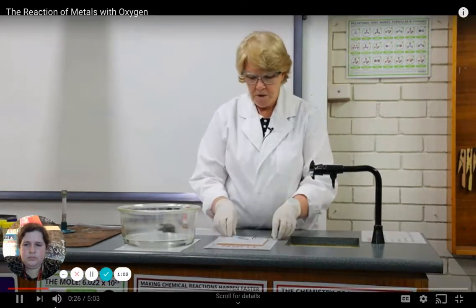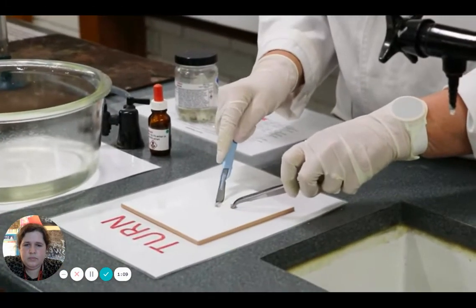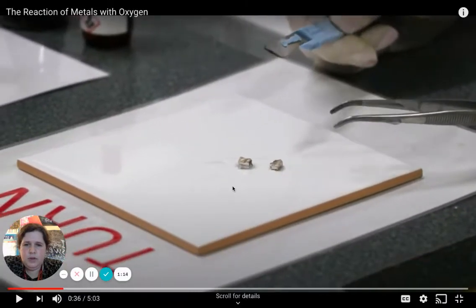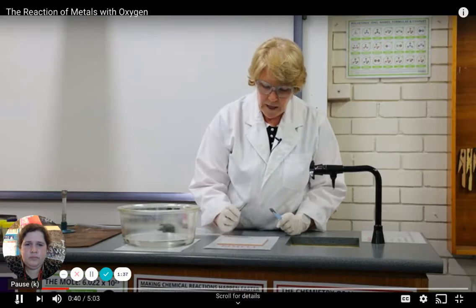Let's cut a fresh surface and observe it. Do you see that the fresh surface is quite shiny? So I believe the fresh surface is this part right here. It's the more silvery part instead of the brownish part. If you look on the top, it's kind of brownish, like a tan color. If you look on the sides where she just cut it, it's more of a silvery color. It goes dull fairly quickly as the oxygen in the air reacts with it.